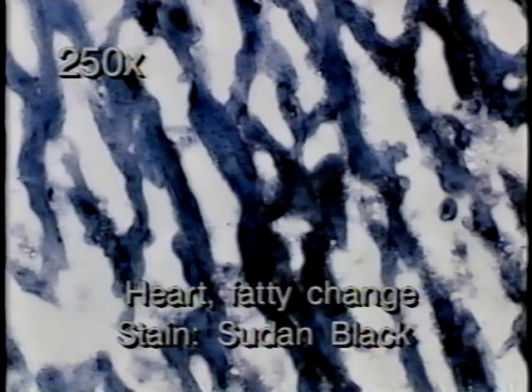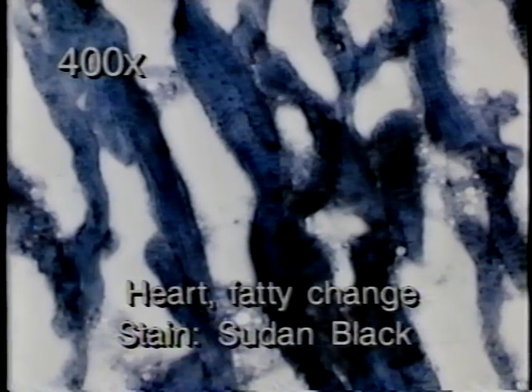This is a section of myocardium from a young man accidentally poisoned by metallic phosphide. This tissue was stained with Sudan black, another dye which selectively binds to lipid. The black areas are collections of fat within injured myocardial cells. At higher magnification, perhaps you can better appreciate the presence of intracellular lipid.